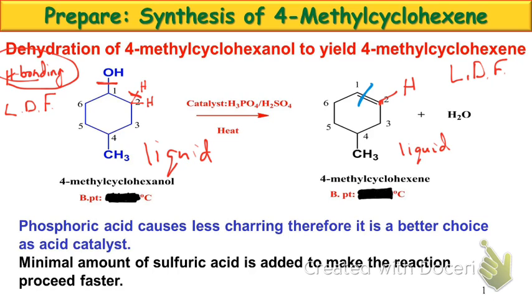How else could we have approached this? No, even easier. I made you derive that distillation would work based on intermolecular forces. That was a whole lot of effort. There's an easier way to do it. Look at the boiling point. You could look at the boiling points, hence the blacked out boxes, so you didn't immediately jump to that answer. And sure enough, we look at the actual results of our boiling points, and all of our predictions were true. We're looking at two liquids with drastically different boiling points.